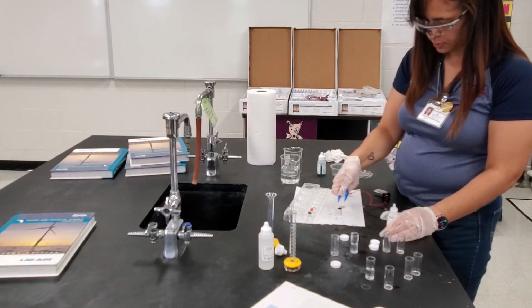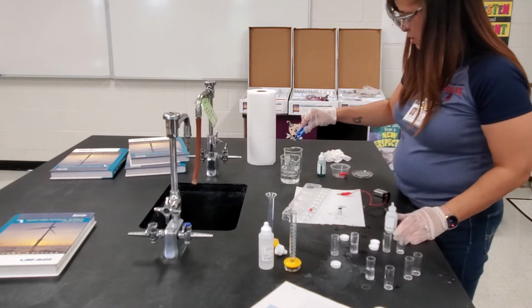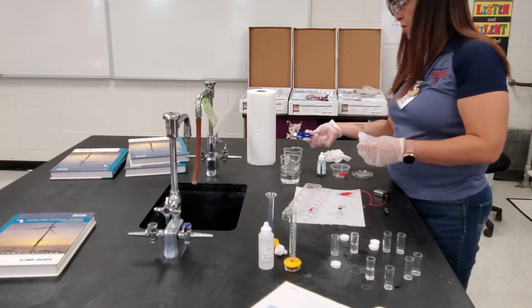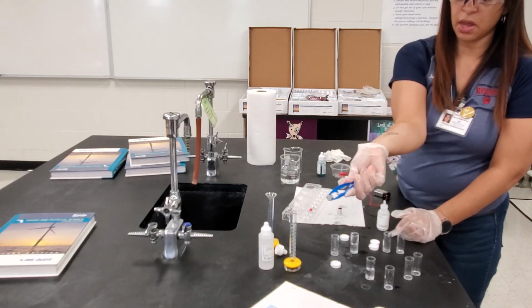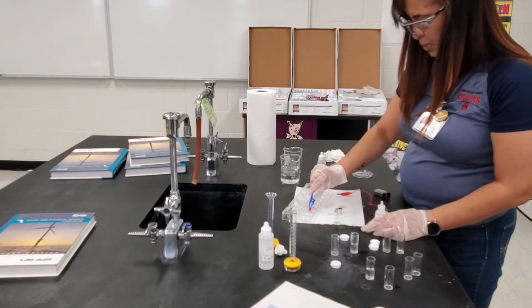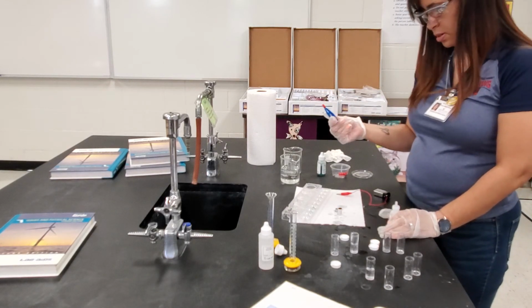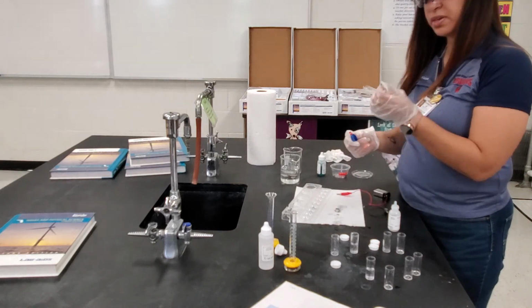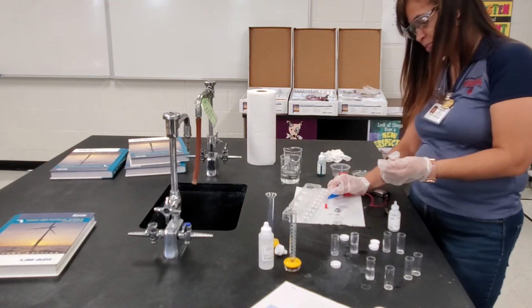For the second one, I'm going to do the same thing. And although the reaction wasn't as intense, you can see there is a discoloration on the metal. There's a discoloration on the surface and on the side. So both of the metals did have a reaction. The first metal had a very dark, big reaction where it turned very dark. The surface, it's hard to tell, but the surface is actually corroded. And the other one, the surface has dulled and has a bit of a color change.